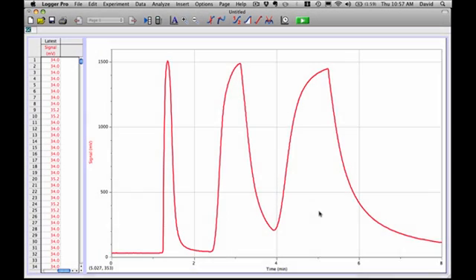Now we're back and the run is complete and notice that we have three distinct peaks. The profile that we set up was pretty good in that it shows us the three substances in the mixture. The shape of the peaks we would like to have look more like the first one you see than the other two.